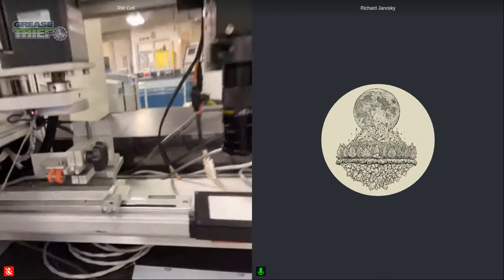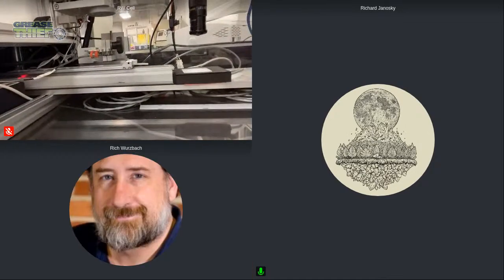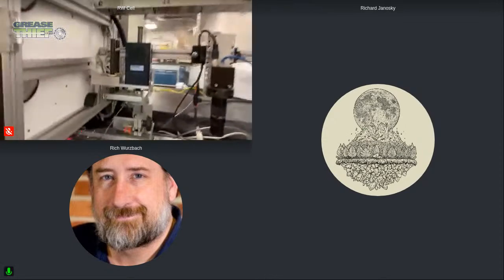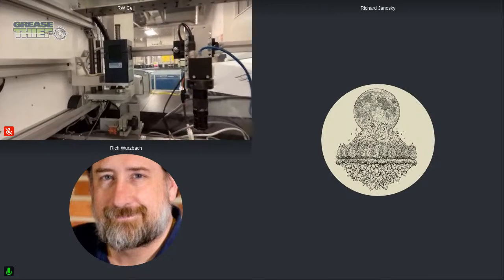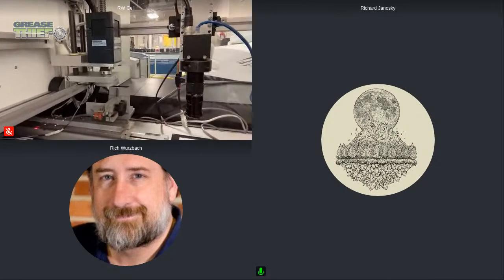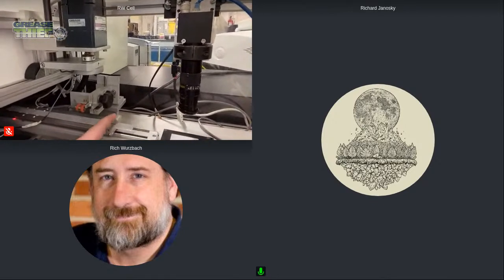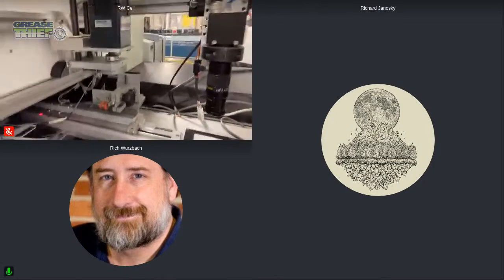And then you can see, I'll lower the camera, the substrate is flat or even with the table because of the relief. Richard, could you point at the little lever that you were talking about there? Yep, and I can undo it. So there I have it loosened, and then there I will tighten that. Okay, very good. Thanks. Yes, no problem.